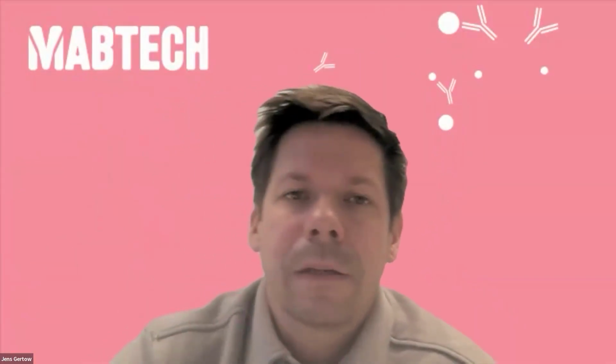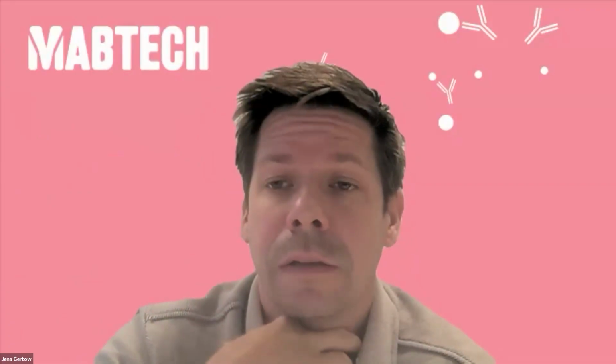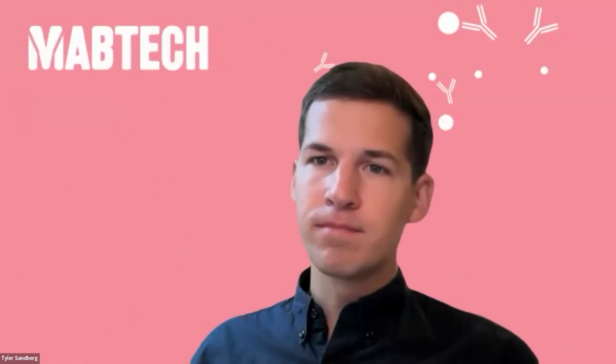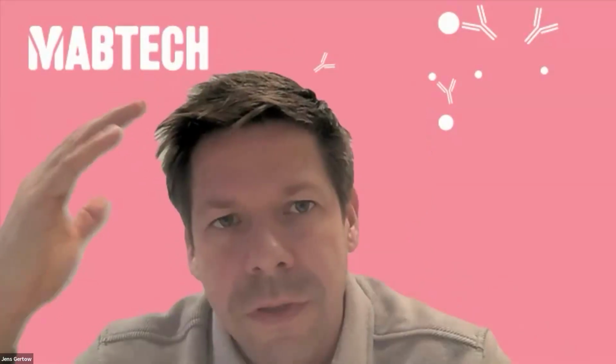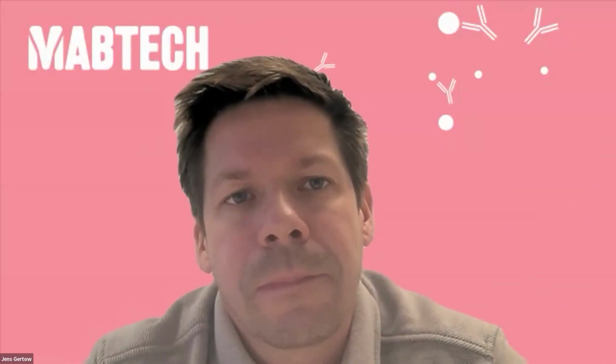Great. Let's do one final question. Then everyone who we have not answered the questions for, we will get back to you through email with a possible answer if we have one. So this is a question that actually came also already at sign up, but now I see it here in the chat as well, which is about medium and serum-free medium, AIM5 medium versus R10 media. The person asking here is seeing differences, high level of background with AIM5. Do we have any idea what's up with that?